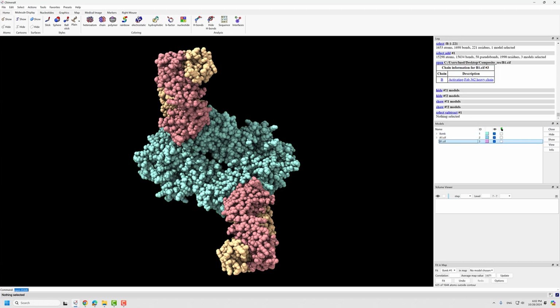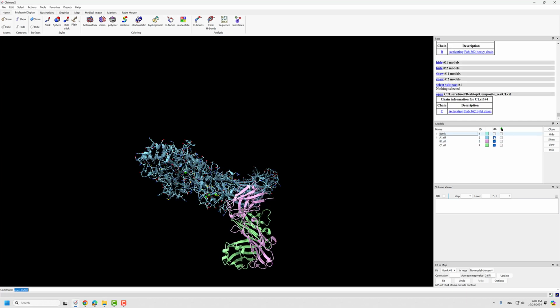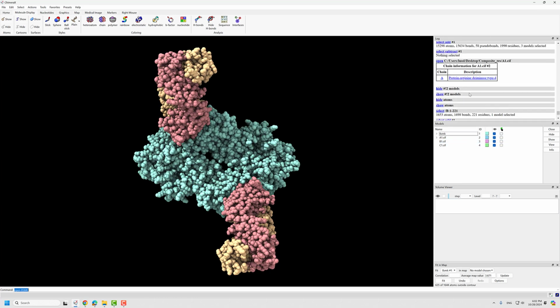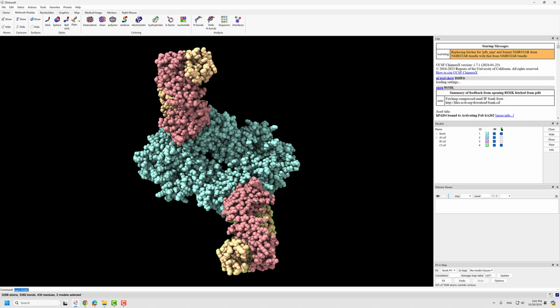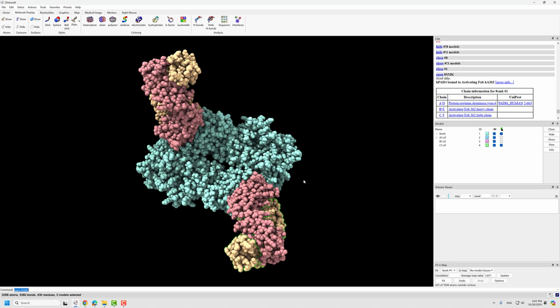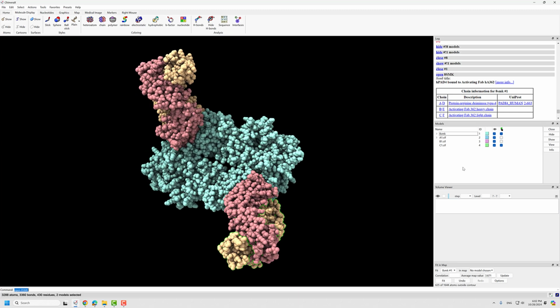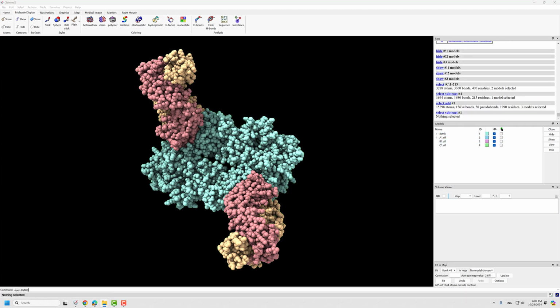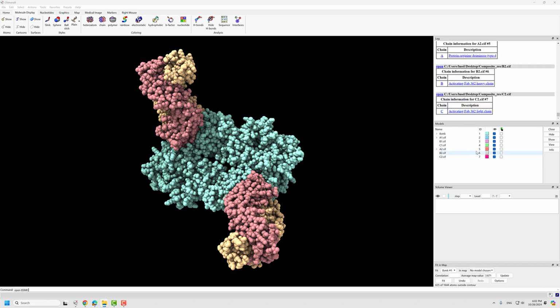So C1 should be the lower side too. Yeah, that's C1. And then let's see if this is, yeah, C1 that goes first. So I think we are doing good. ABC, okay, then let's drop 2B, 2C2 in.